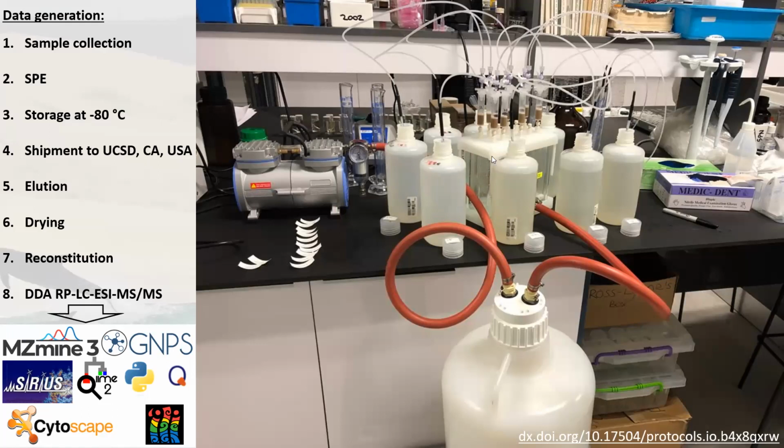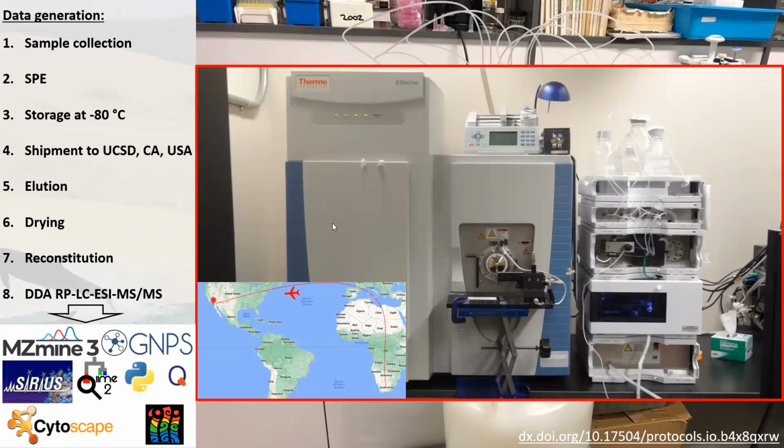So essentially we just apply a vacuum to this manifold here with our solid phase extraction cartridges up on top. And then we suck the water samples through the cartridges in the hopes that our organic compounds of interest stay adsorbed. And then we stored those at -80 degrees. And then they were actually shipped across to San Diego, where they were then reconstituted and analyzed on an Orbitrap. And that's basically what you see here, the exact instrument.